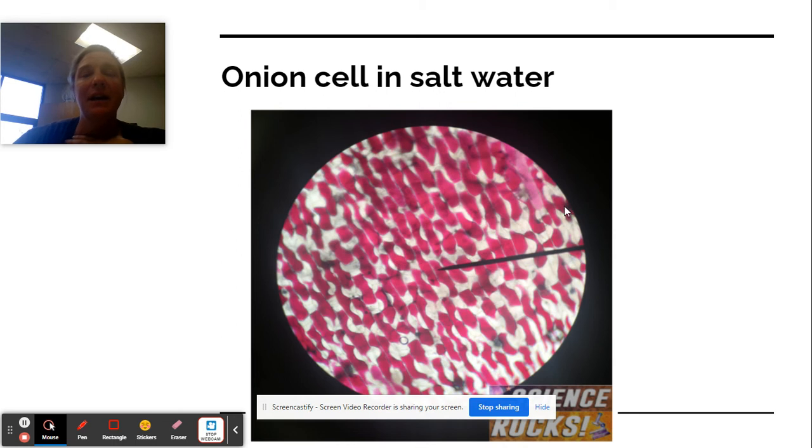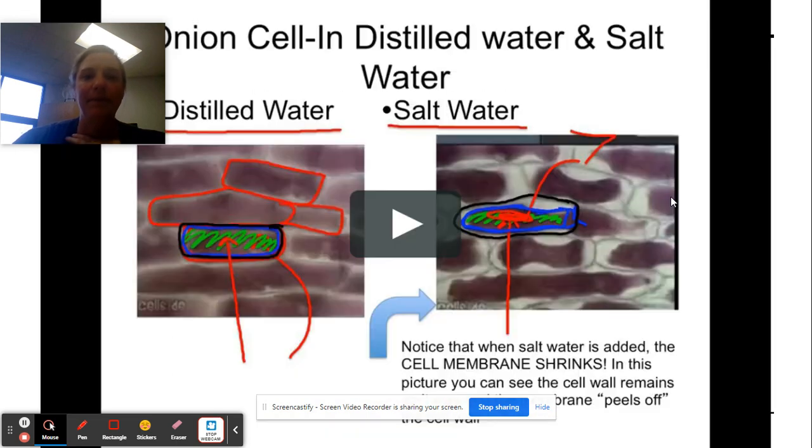The cell membrane didn't have control of how much salt was coming across, but when you immersed it in salt water, when it's not supposed to be in salt water, this is what's going to happen on a cellular level. And so this is a good indication of why, if you're really thirsty, like if you're stranded in an ocean, you cannot drink salt water. It will actually kill you because of what it's doing to the cell. So imagine this on a grander scale, like your body. It is going to break down those cells, and they're not going to be able to function normally.